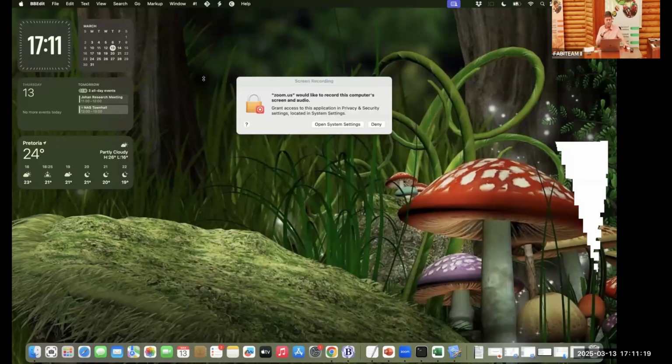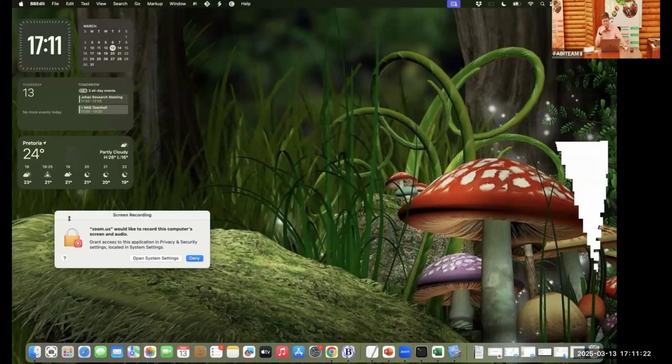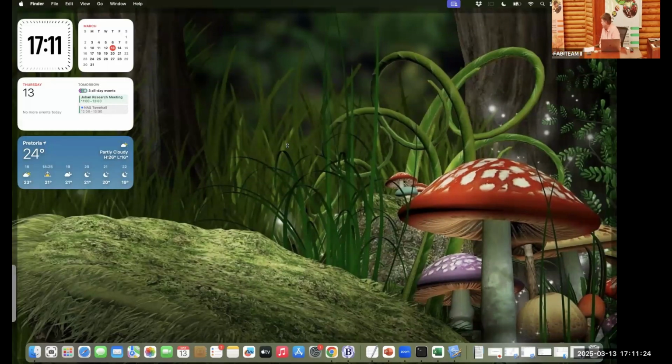Abigail also provided some information on why you would like to use the online version. If you have a large data set and your computer doesn't have the power, this is an ideal way of doing it. And of course, with all this software, once you move into the use of a server, you cannot use an interface. So with large data sets, bacterial genomics, fungal genomics, phylogenomics, we use servers, and you do that through the command line.